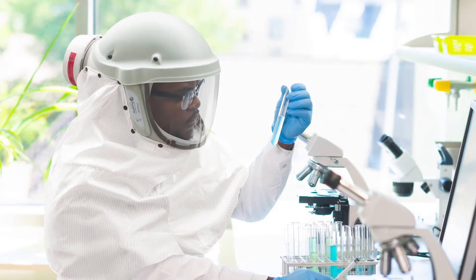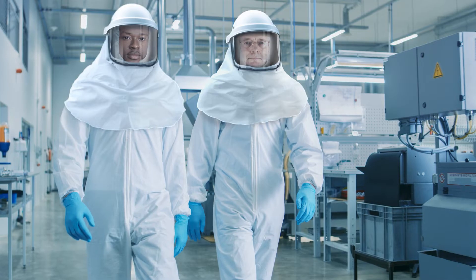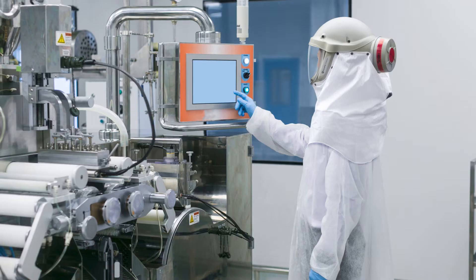The PureFlow ESM Plus PAPR is the new breed of industry-leading all-in-one air purifying protection systems.